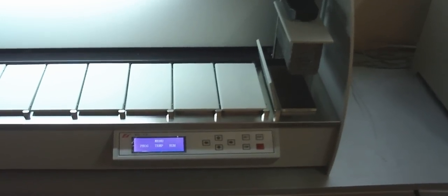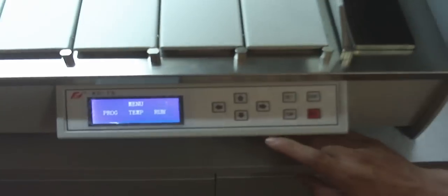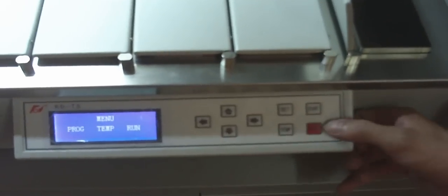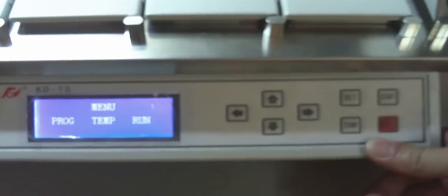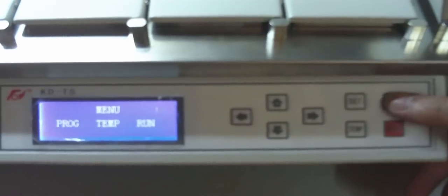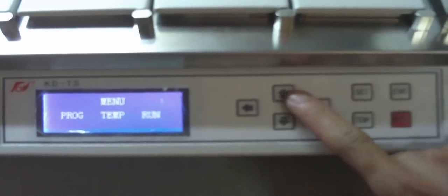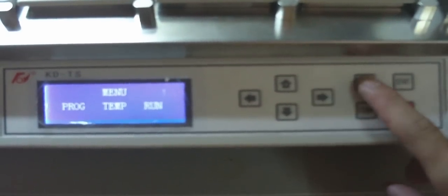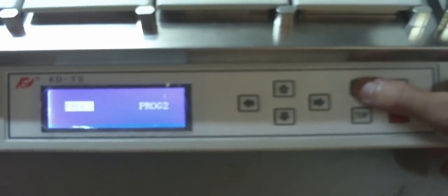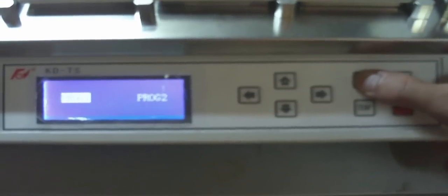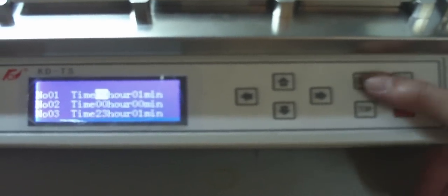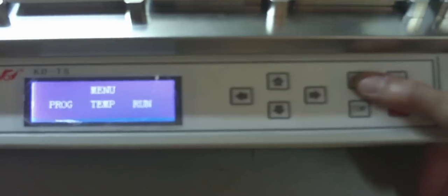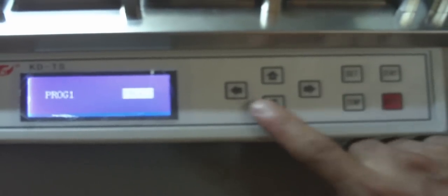Press the PROG key to enter the program interface. The instrument has two program sets. Press the left and right keys to select between Program 1 and Program 2.